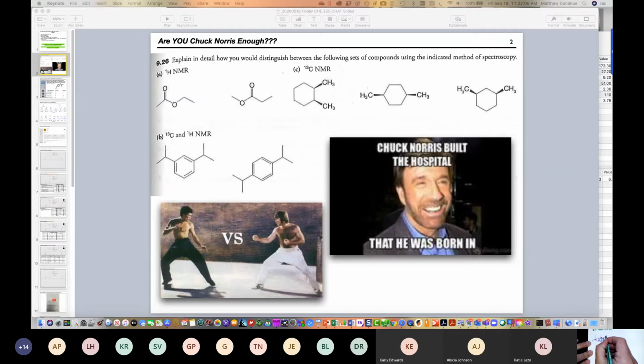The CH3s of the methyl, that's 1. The methine is 2. This does not have one. This is unique, so that's 3. That's unique, that's 4. This is unique, that's 5. Sorry, the plane that I drew with the dotted line, there's a hydrogen there. If you missed that, that could be the 5th. So 1, 2, 3, 4, 5.